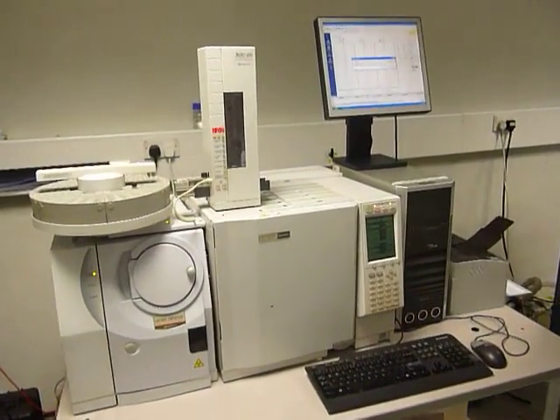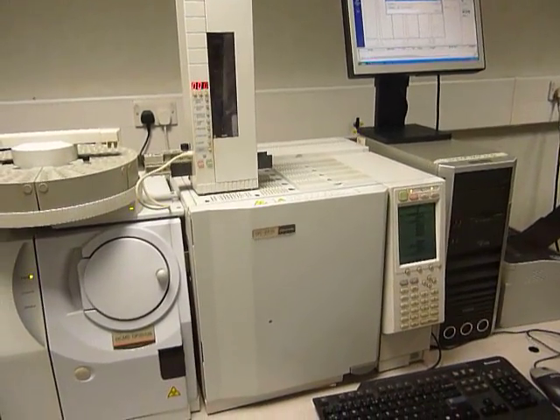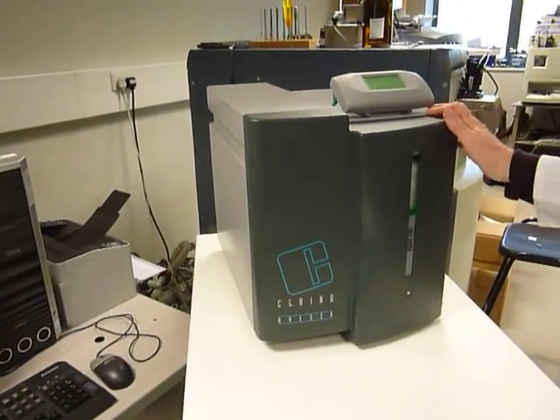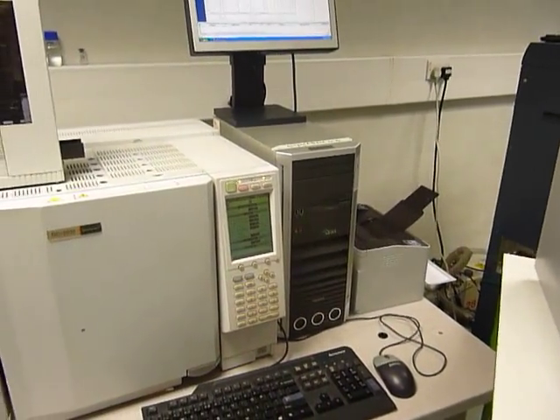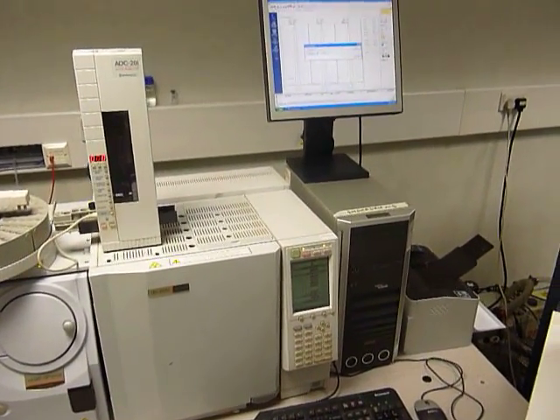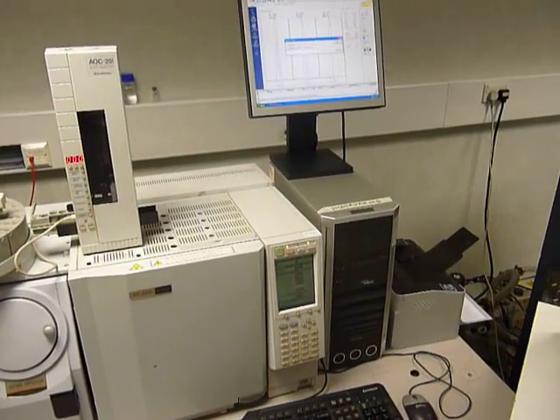We have here a Shimadzu GC2010 GCMS. In this case, we're using a hydrogen generator to produce the gas that runs through it. I'm going to show you how simple this single quad instrument with a range of mass 50 to 700 runs using the software that's provided.